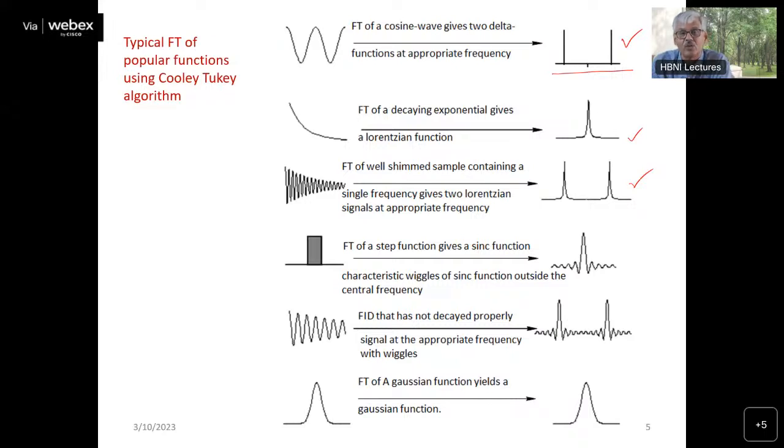So how are we doing it? We are splitting the signal, and then we are doing a phase shifting. One is a cosine function and the other is a sine function, and then we are mixing with our reference frequency, and finally we can find out. Suppose you take only this FID, then you get two signals.